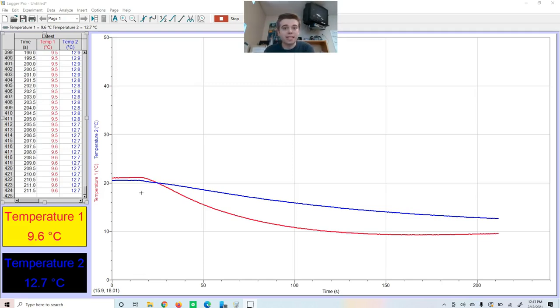And remember, that's going to be T1, and we can record our minimum temperature, which we will record as T2. So we have probably 20-ish more seconds left. Notice here how our blue temperature still continued to decrease fairly slowly, whereas the red temperature decreased very, very fast. So it evaporated very quickly. And now we can see that the red temperature has already started to increase.